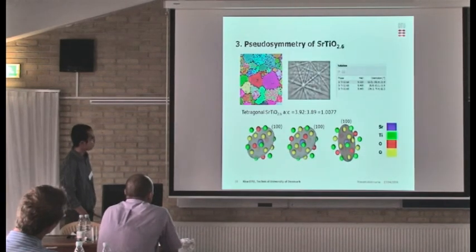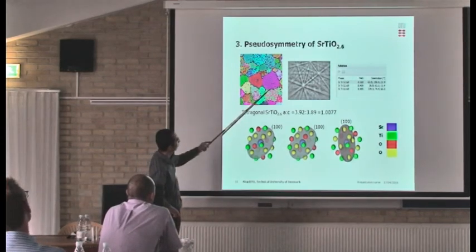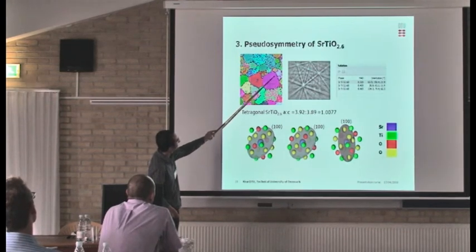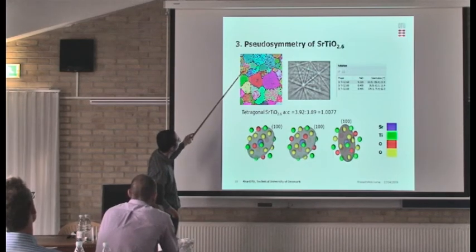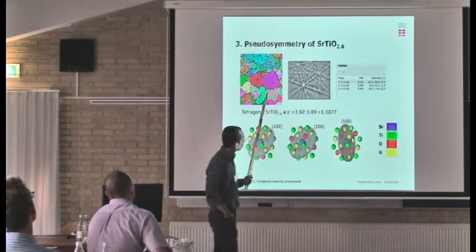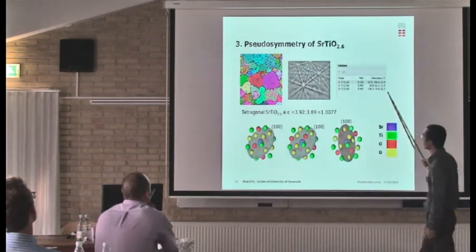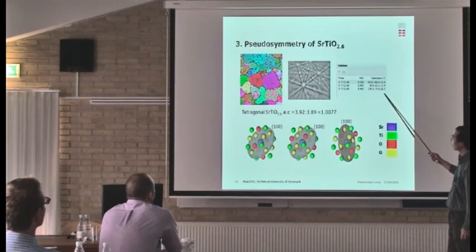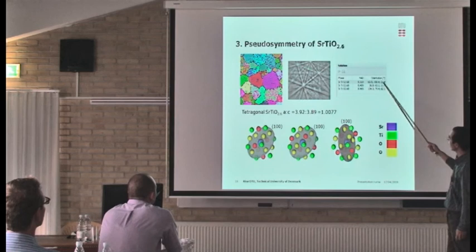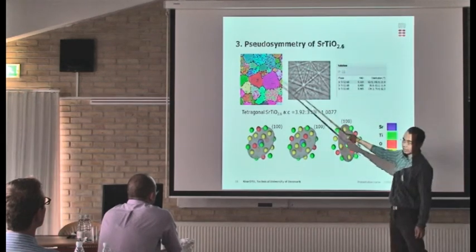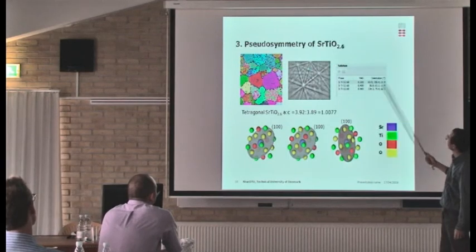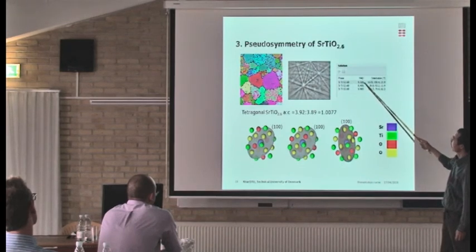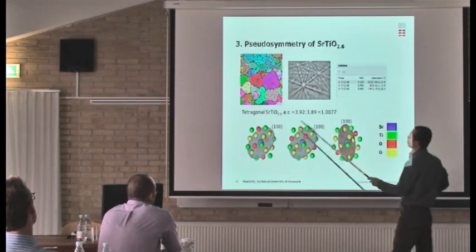Here is a small pseudo-symmetry example. If we look at a grain, you can see that some grains have only one color, while some grains have two colors. Here is the indexing solution — the software always finds three solutions at each point, and of course the software chooses the best one, but the rule still has the answer.